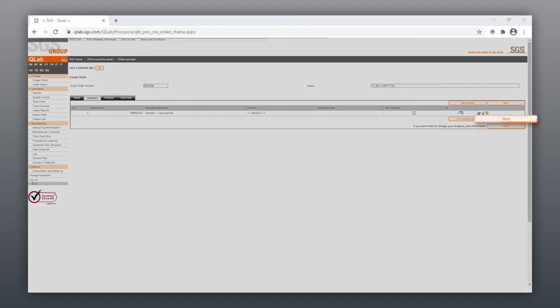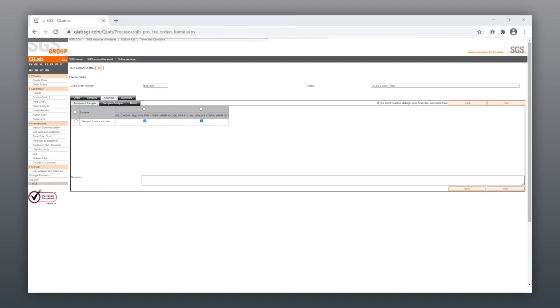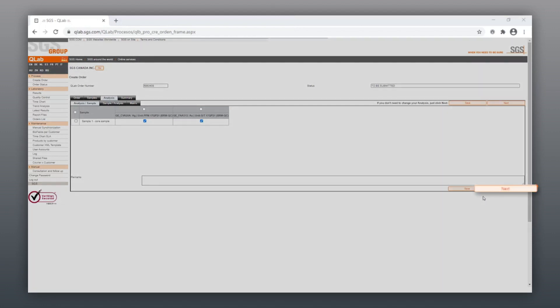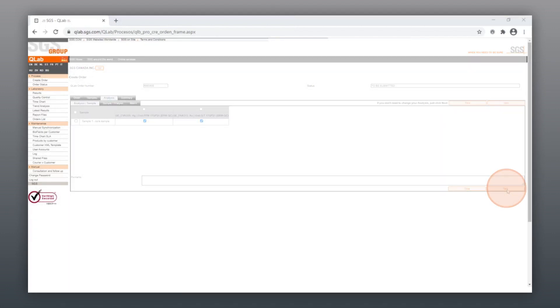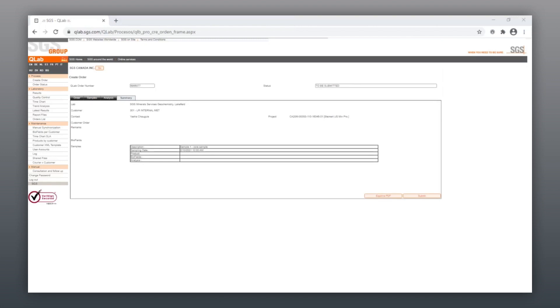On the Analysis tab, confirm the method of analysis required for each sample submitted. Once completed, click Next to review your order summary and then select Submit.